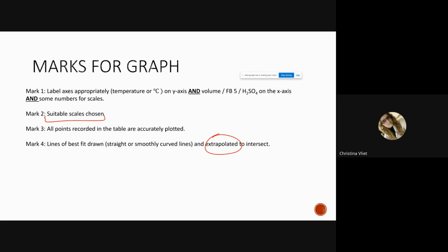Just like with a burette 0.05, with a thermometer, you record to the nearest 0.5, and you have to write either .5 or .0. Make sure you are wearing glasses.